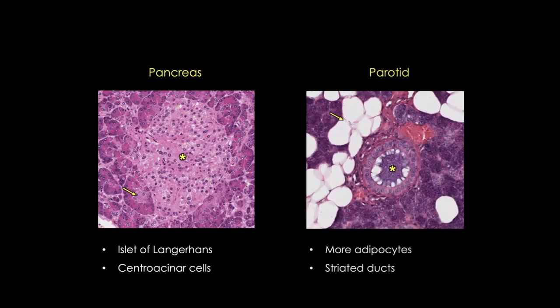You should now be able to better recognize the pancreas by the islets of Langerhans and the central acinar cells, and contrast them to the increased amount of adipose tissue and the striated ducts of the parotid gland. I hope these tips will help you solve this case of mistaken identity. Thanks for stopping by — be sure to check out my other cases of mistaken identity.